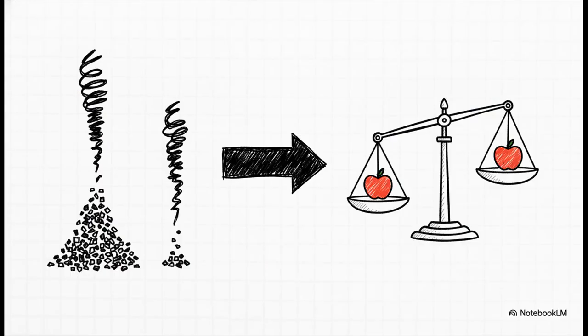But hold on. Actually, scratch that. We can't just directly compare these raw numbers yet. We have to do some math called normalization. The sources are really clear that we must remove technical biases first. For example, think about gene length for a second.